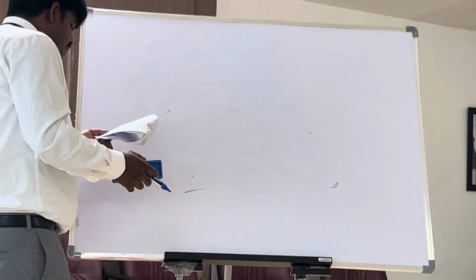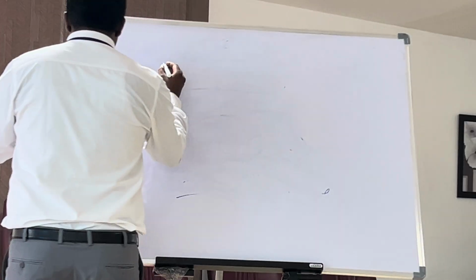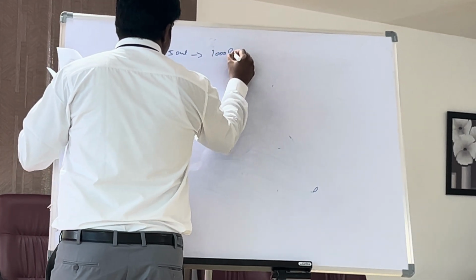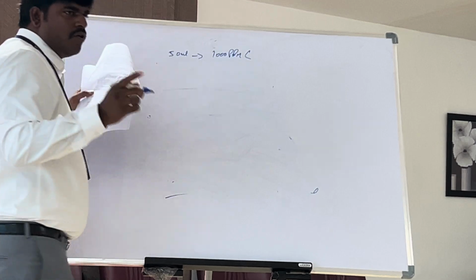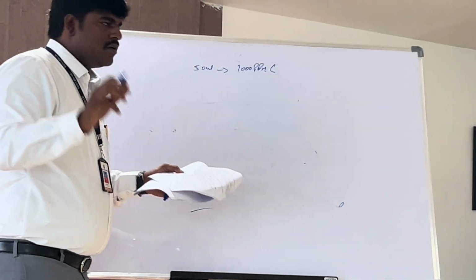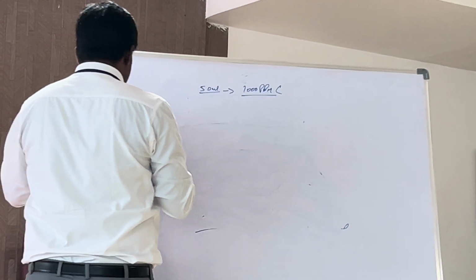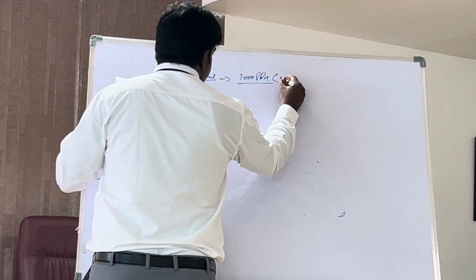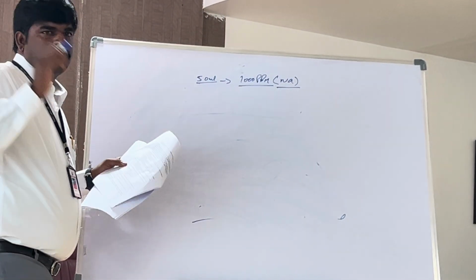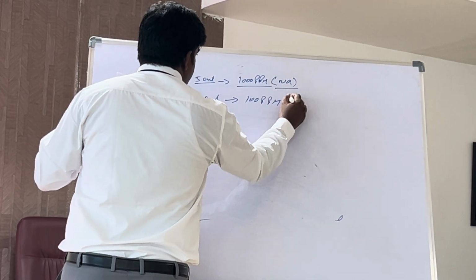So for example, if you had a standard, if you have a 50 ml, 1000 ppm solution. Basically, if you go with AAS or ICP-MS, whatever standards you are getting in liquids, that is the stock. So for example, you have 50 ml of 1000 ppm solution in water, here it is given as sodium. From this, you need to prepare 100 ml of 100 ppm solution.